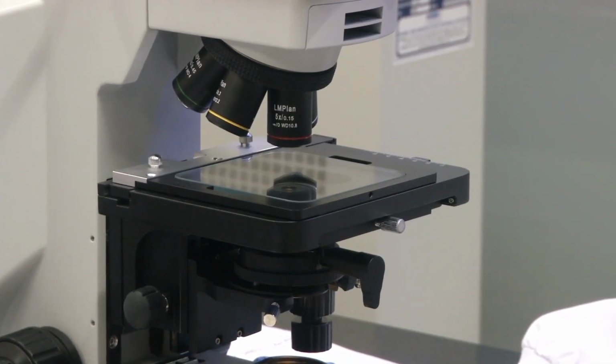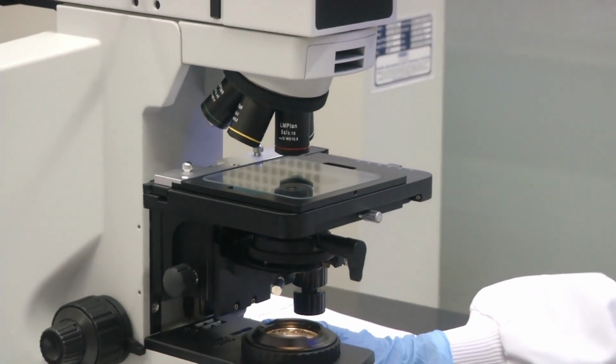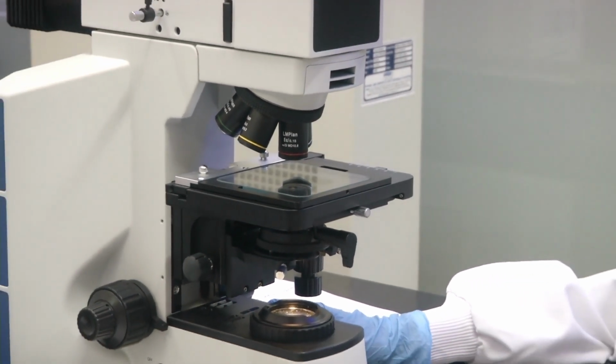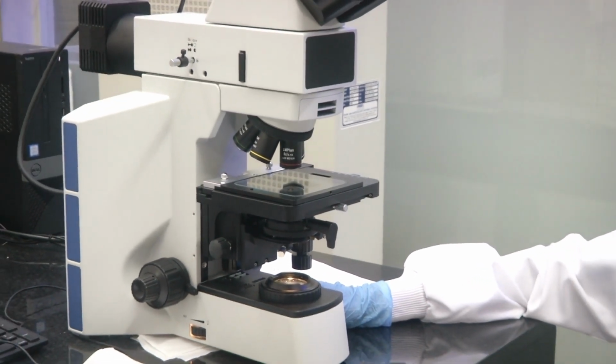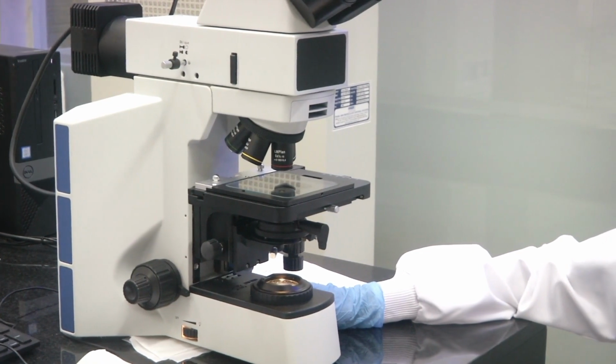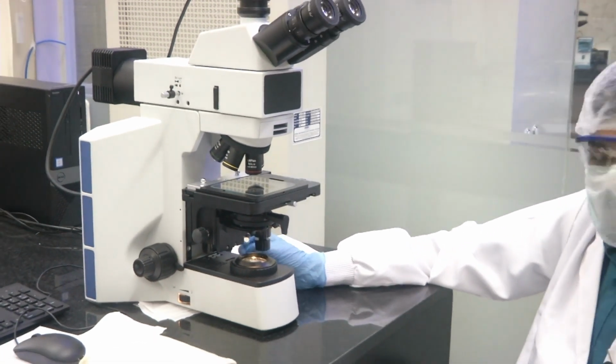Now, why are they important? When we saw the stereo microscope, the illumination was coming from the top. So, what would happen in the stereo microscope? The light coming from the top falls on the sample, gets reflected, and is picked up by the eyepiece. But in this microscope you have both options.